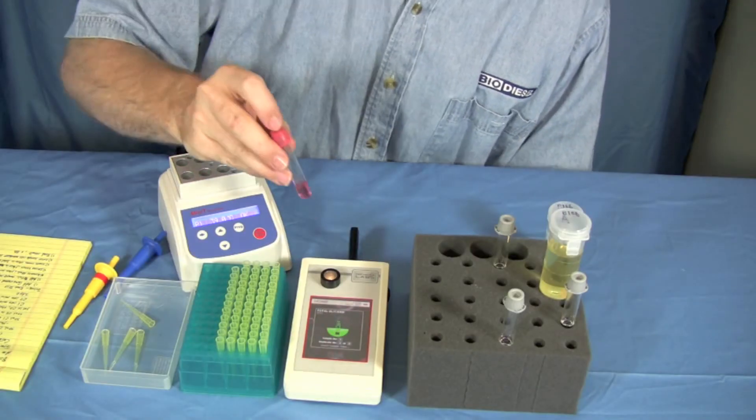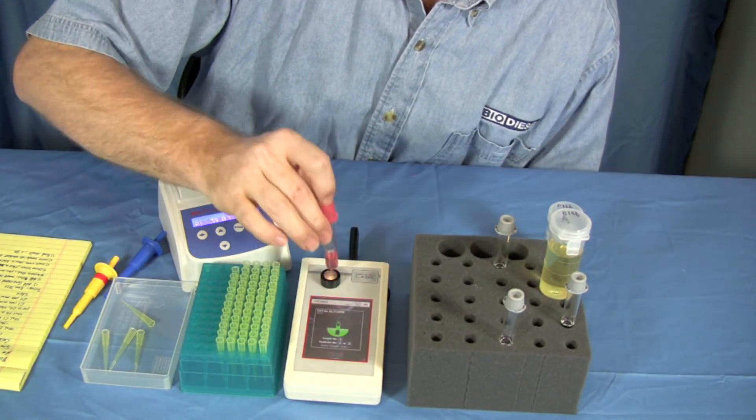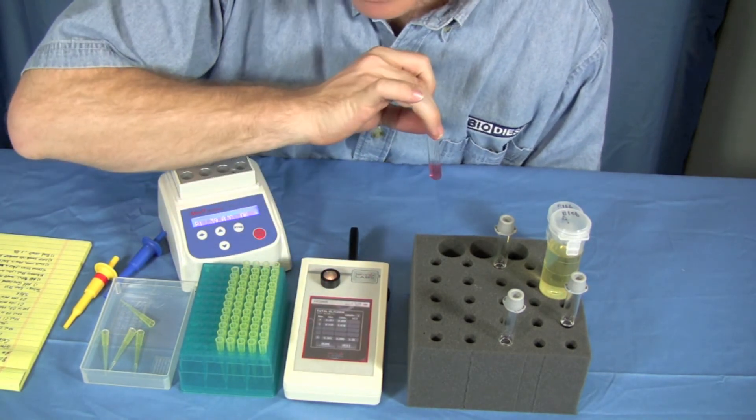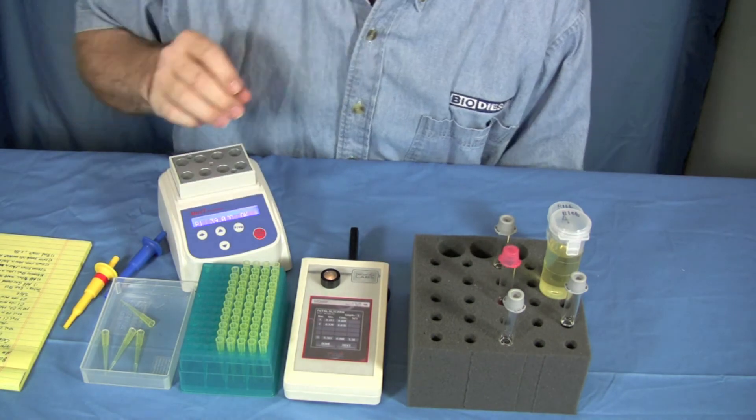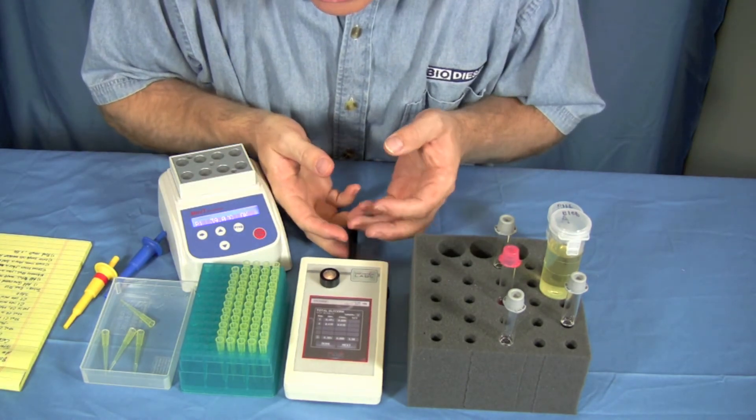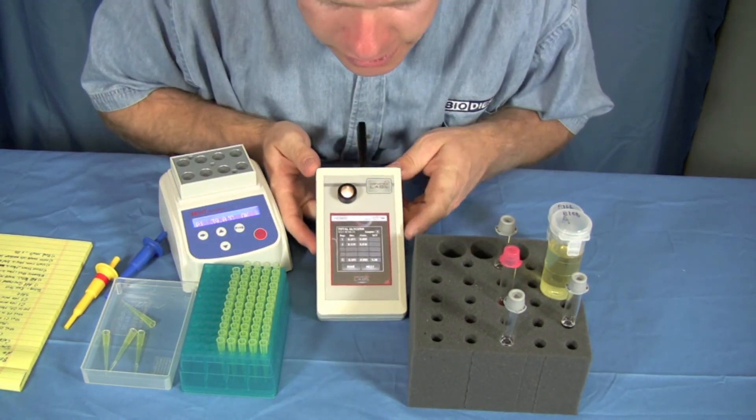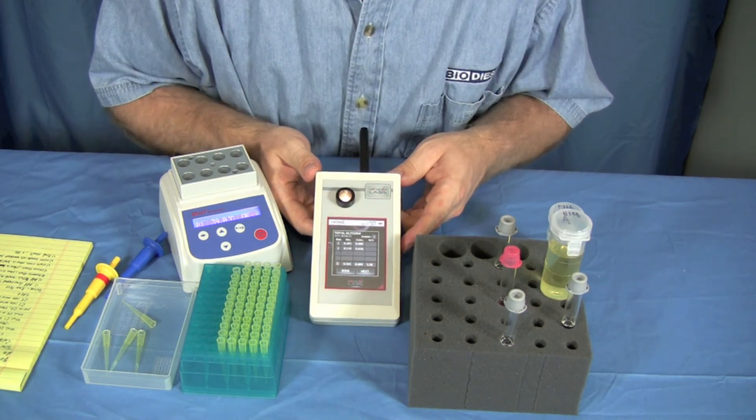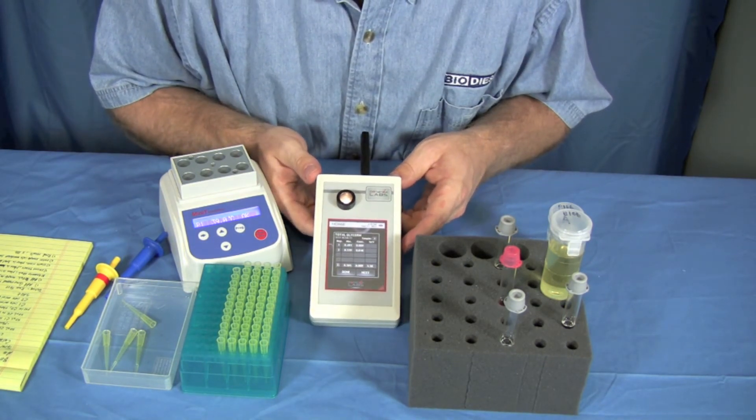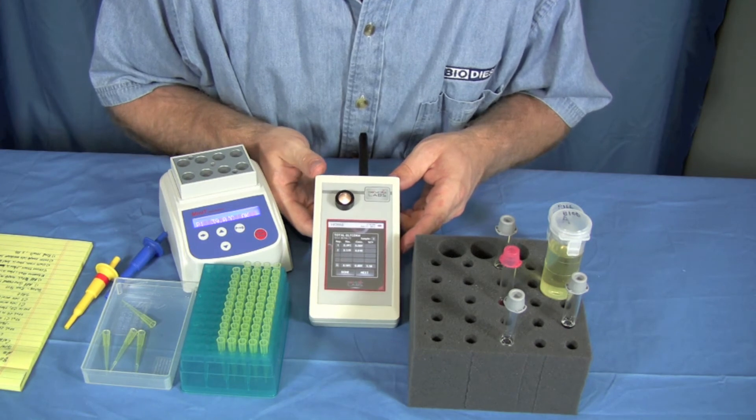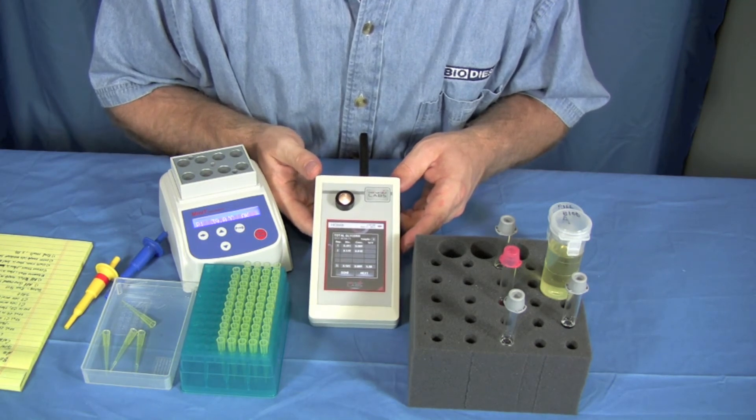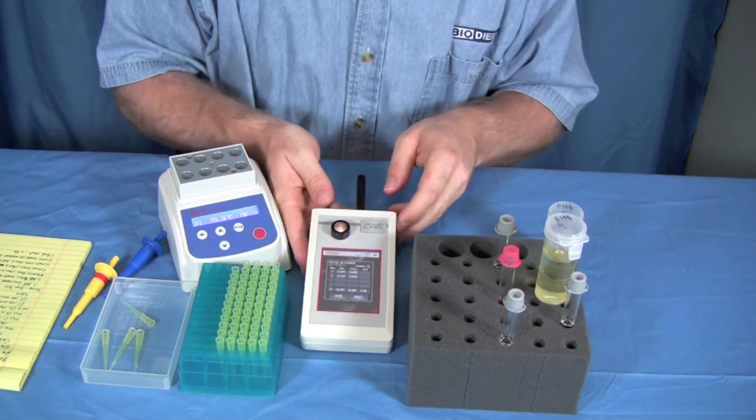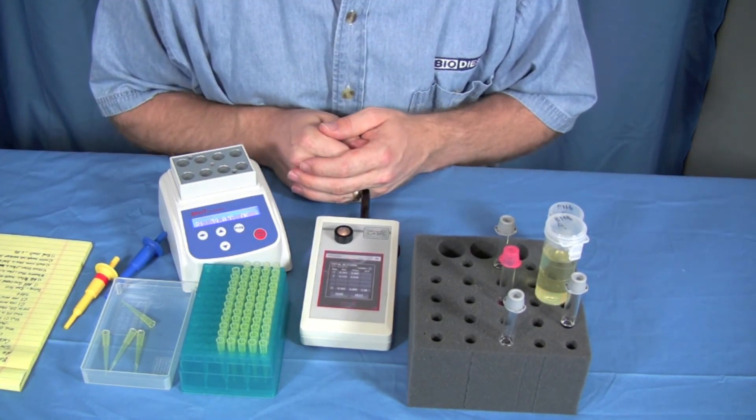Okay, so in we go. This fuel tested really, really good. This is 0.009 or 0.09% total glycerin, which means this fuel would meet ASTM standard. Which is awesome. We've got really good fuel here. And that's how you do a total glycerin test.